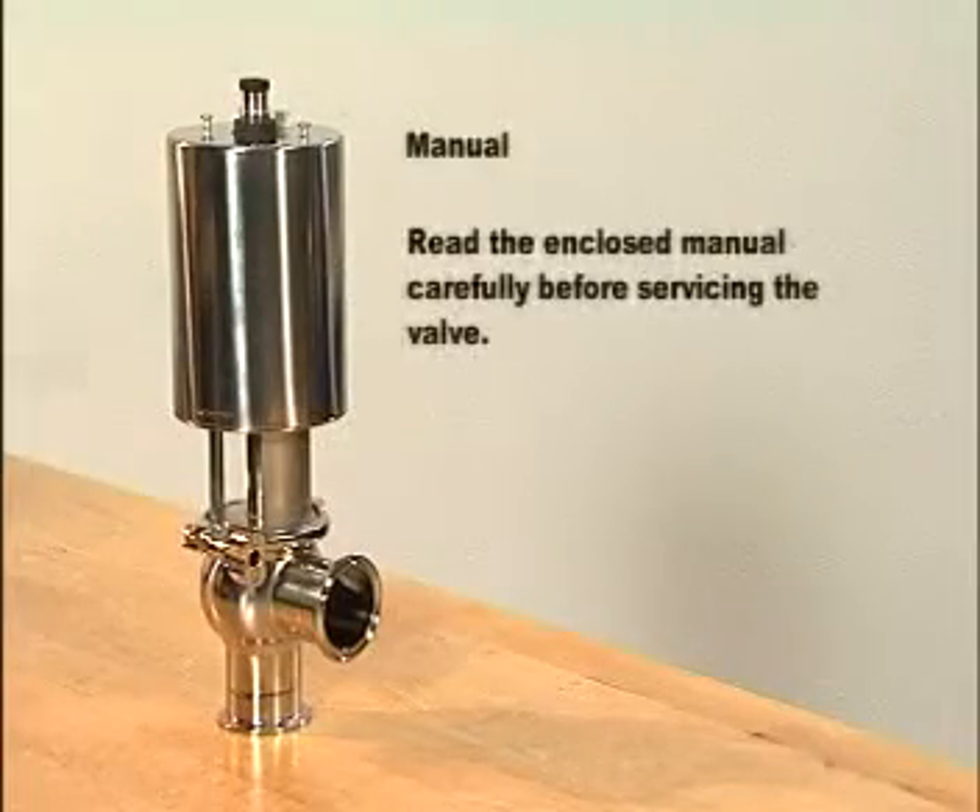Read the enclosed manual carefully before servicing the valve. Always be careful not to damage product wetted parts, and during service, always place dismantled parts on a clean surface.